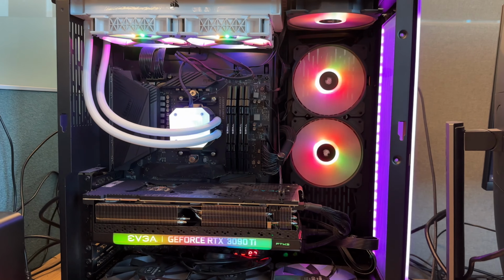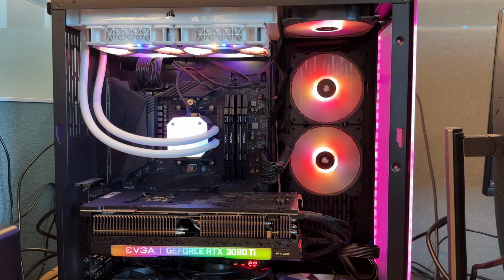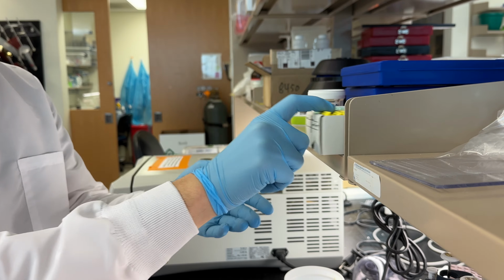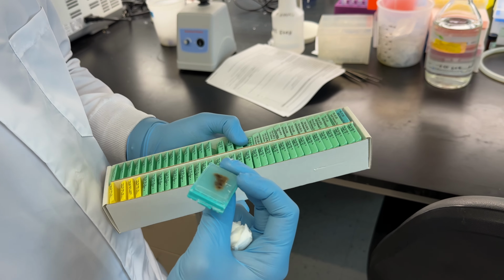So my lab develops methods and software for analyzing microscopy images of cells. We do this mostly in the context of something called phenotypic drug discovery, which screens thousands of different drug perturbations on cells to make cells that have disease look like healthy cells.